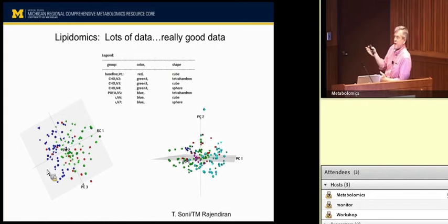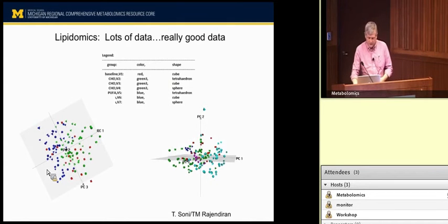Remember, these are paired individuals, so we can connect each one of these spots to each one of these spots. The baseline is clustered, and more of the baseline is clustered with the carbohydrate diet. Then there's a cluster right here, all these little ones. These are the pooled samples that we put together from all the samples, which is very satisfying. When they all get together in one place, it means that throughout the run, when we assayed these samples, they cluster together, which tells us the experiment is working the way it should.